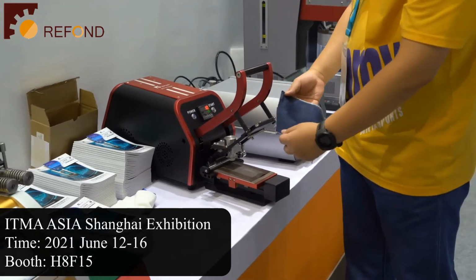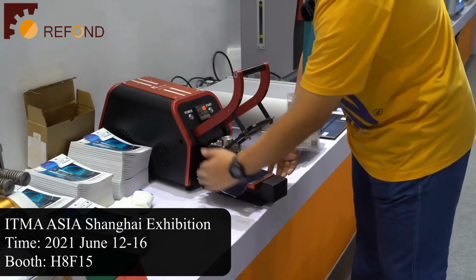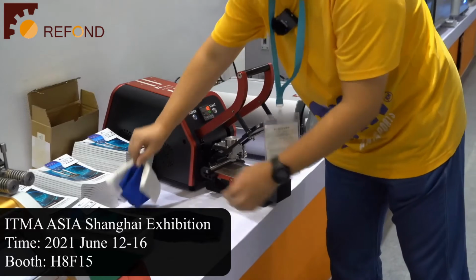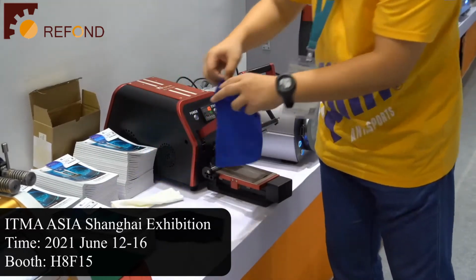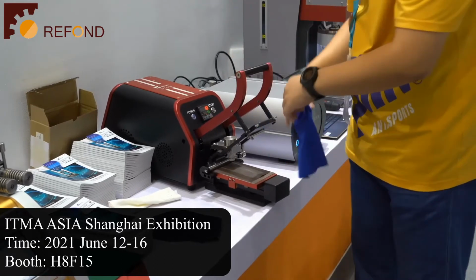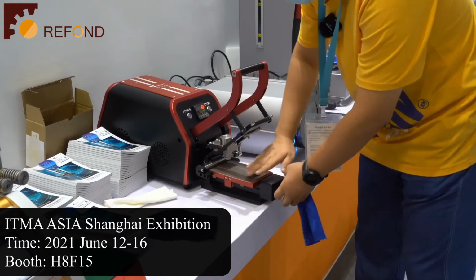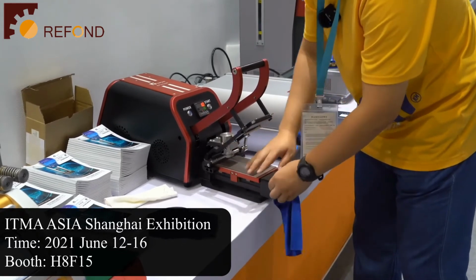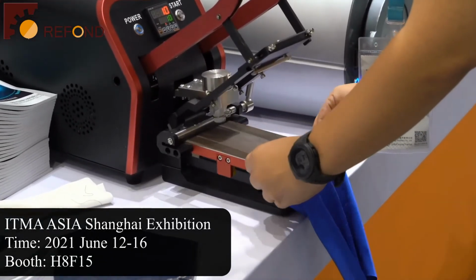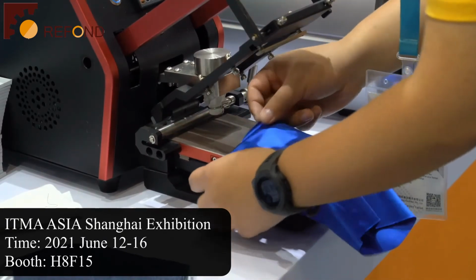So even a very large specimen can be put in directly without needing to cut the side and then the length direction. We can also do non-destructive tests on specimens like a sleeve or trousers. The underside of the specimen holder is hollow, and then the top side is also empty on both sides. So you can put the specimen in like this. Just slide it in gently.